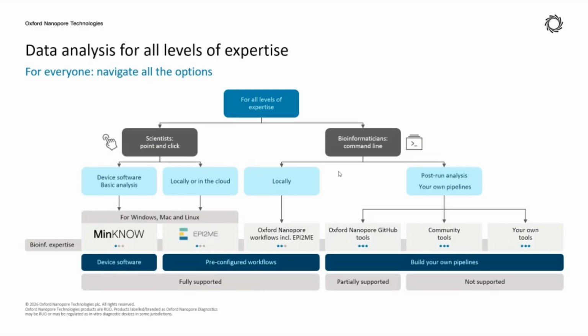Because ONT sequencing, or nanopore sequencing, has been used by many users and adopted in many different domains, there is also a lot of public software available out there for ONT users to manage or analyze the data.